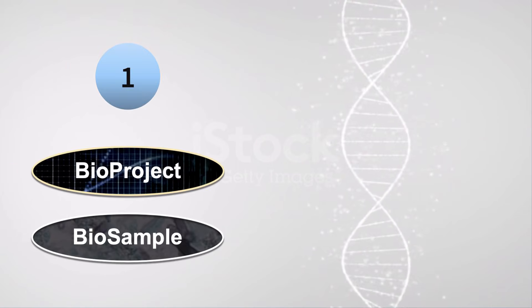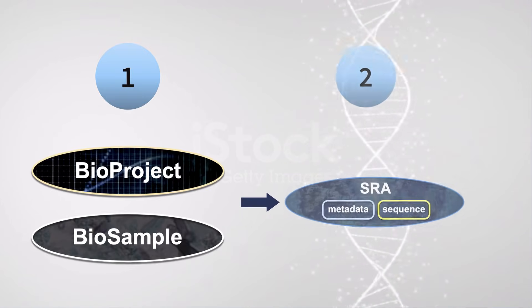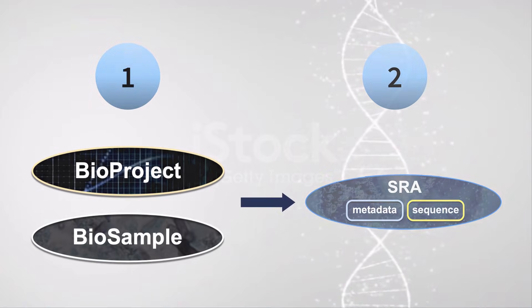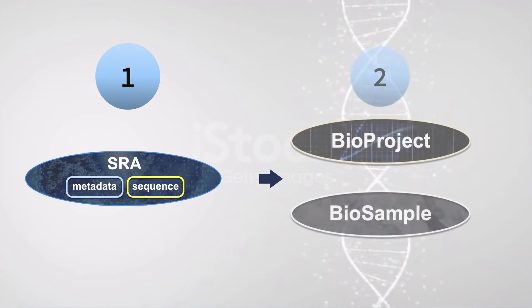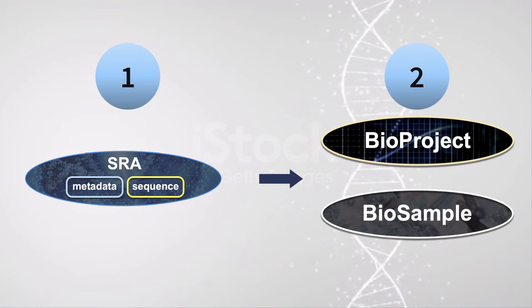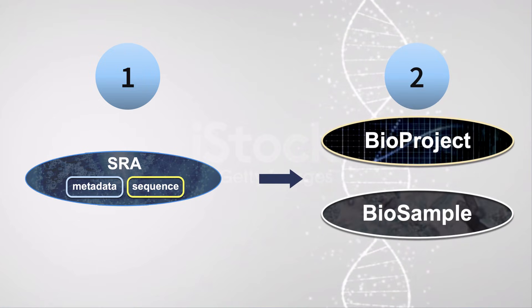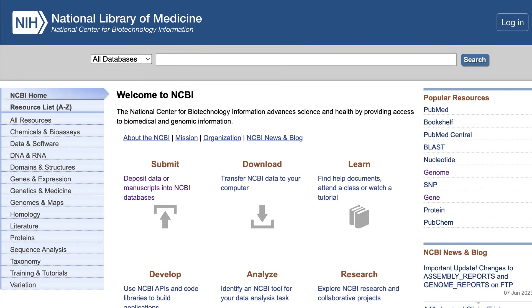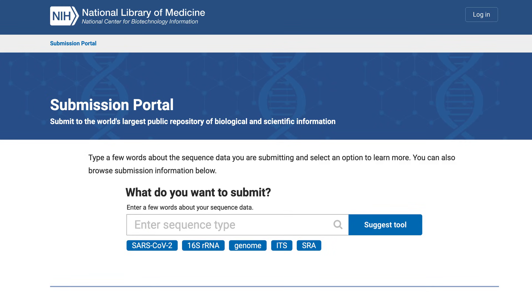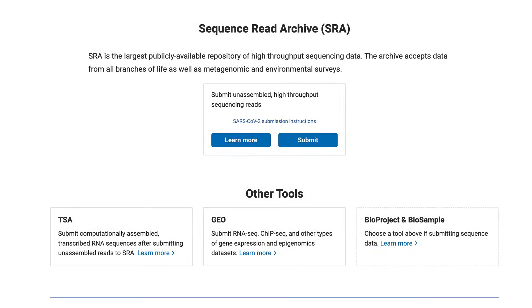You can create bioproject and biosample submissions before creating an SRA submission, or you can start an SRA submission and create bioproject and biosamples as part of the SRA submission. That's what I'll be doing in this demonstration. To get to the SRA submission wizard page, you can start on the NCBI homepage. Click Submit, then scroll down to the SRA section and click the Submit button.